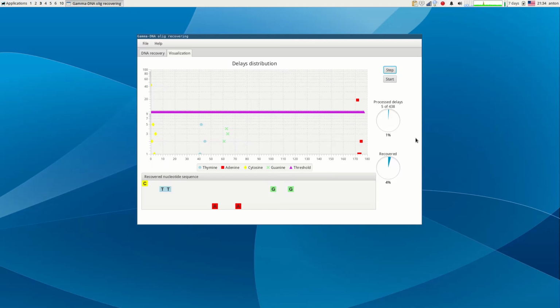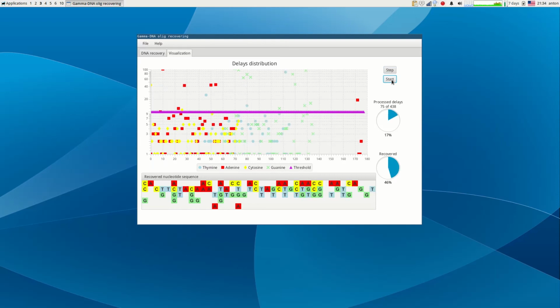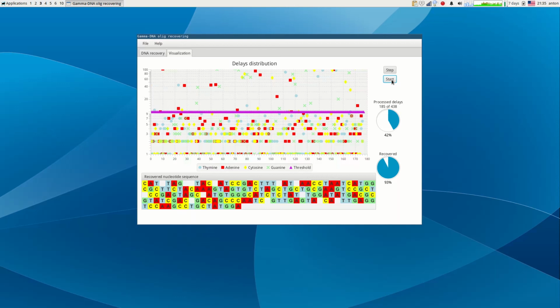As the program processes the subsequent data, we can recover the oligonucleotide. The program is running until it's fully recovered. During this demonstration, the program makes 2 steps per second. For each step, 5 nucleotides from each solution are calculated. Therefore, the complete recovery of the oligonucleotide will take some time. Let's wait for the end.